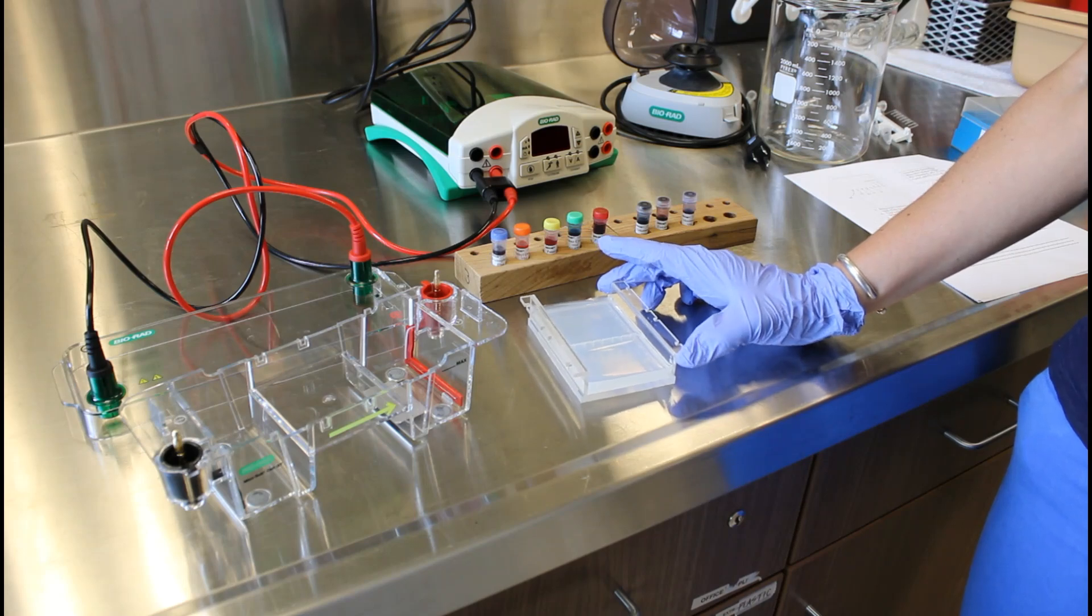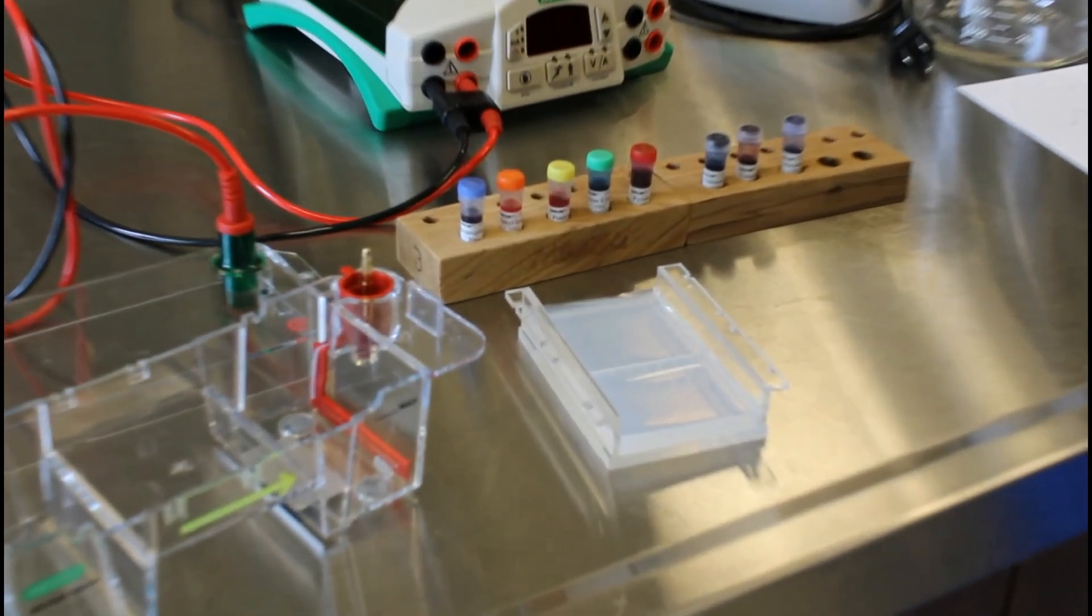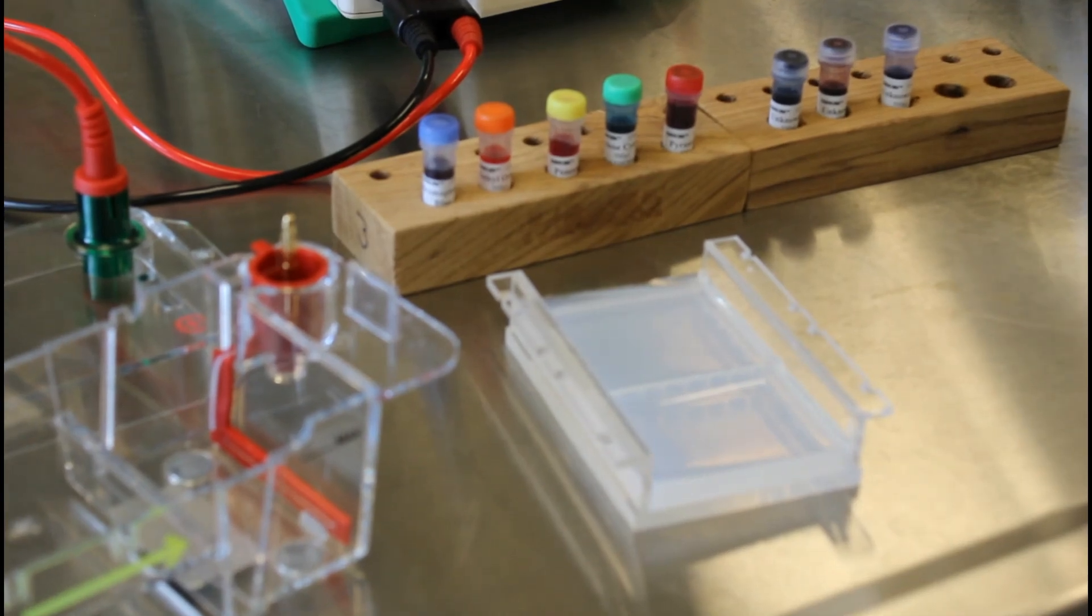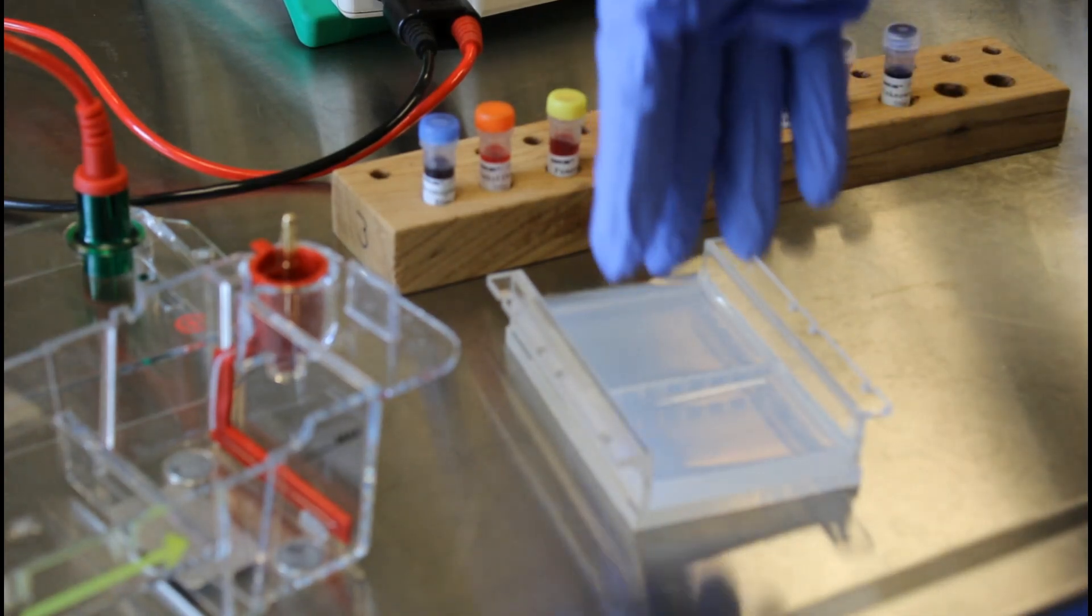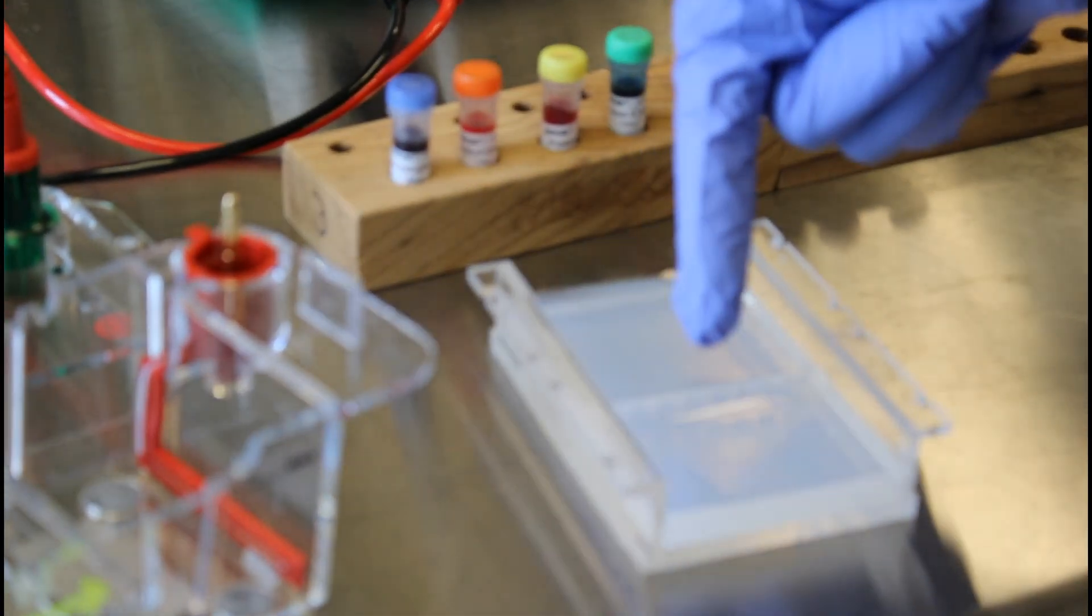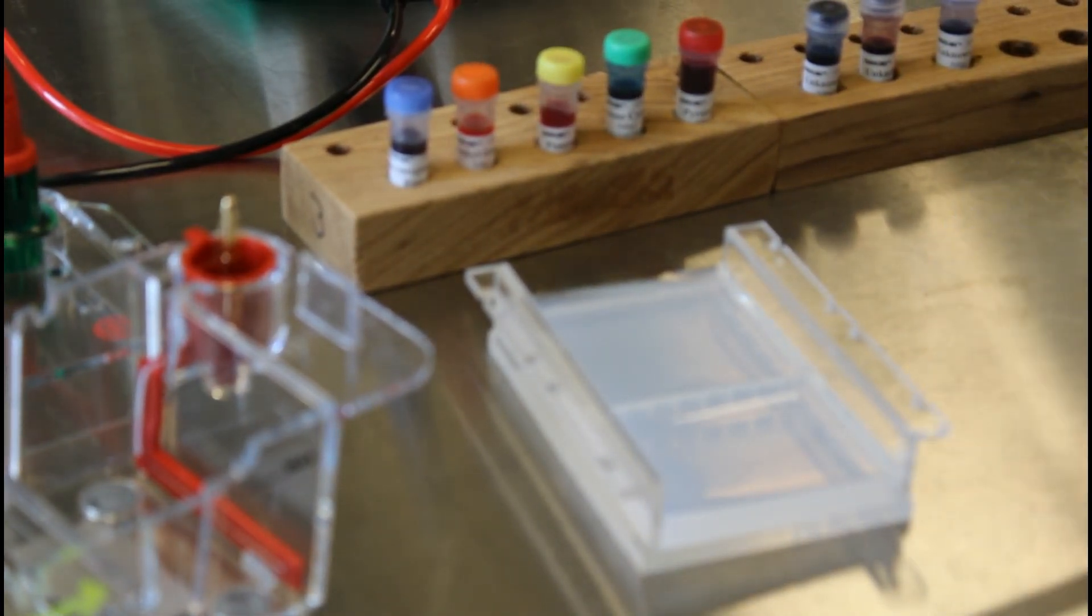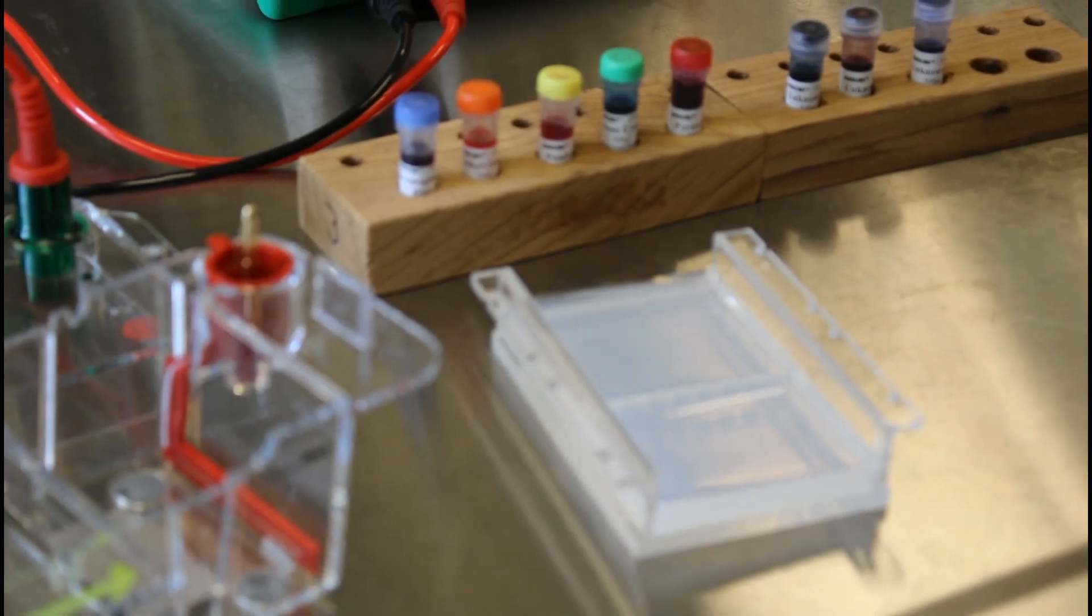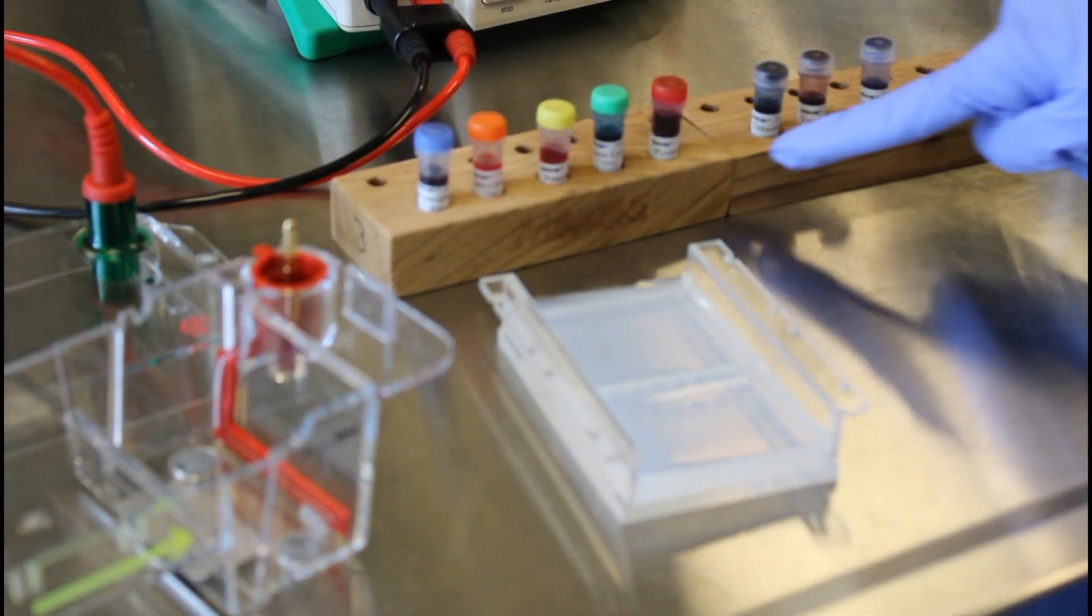So this is our gel. It's kind of like gelatin, you can see this translucent clear material. It's a lot like jello and we made this with a little comb inside so you can see there's one, two, three, four, five, six, seven, eight little holes that the comb left in the gel. Those are called wells and we're going to fill those little wells with these substances.